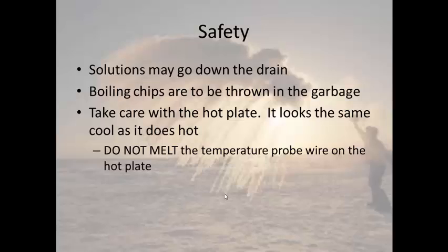Safety for this lab, all the solutions may go down the drain. However, you will be using boiling chips that you do not want to throw in the sink. You don't want to just dump them in the sink. You need to throw those in the garbage.